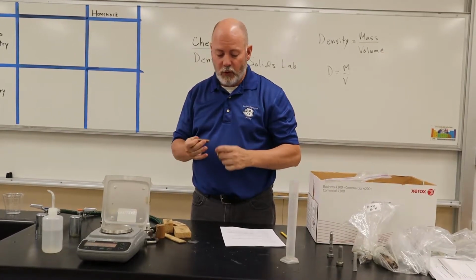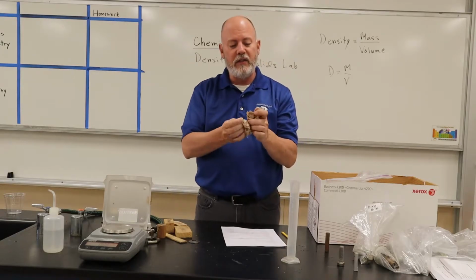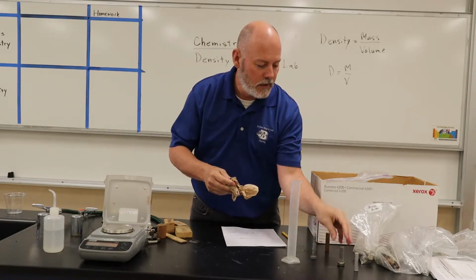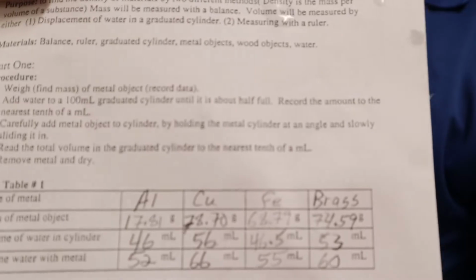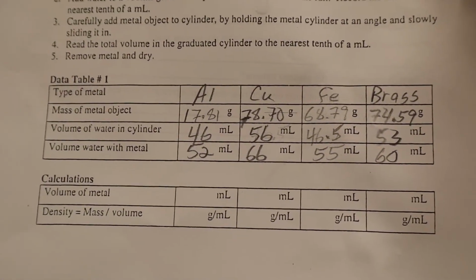Now it's time to do the woods. So make sure to dry these off, especially the iron bolt, because remember, iron rusts pretty easily. Okay, so you can see the data I recorded in my wonderful handwriting. So that's all the data.